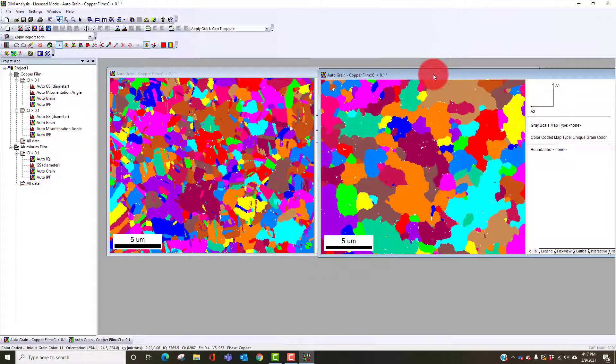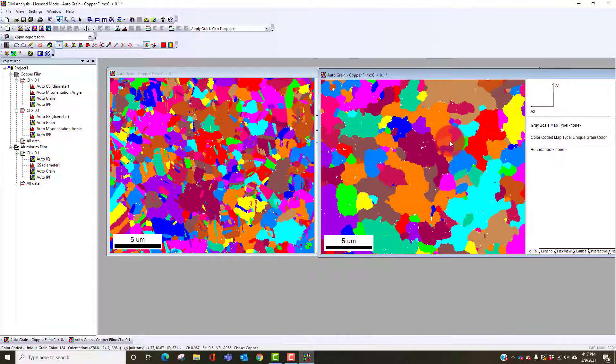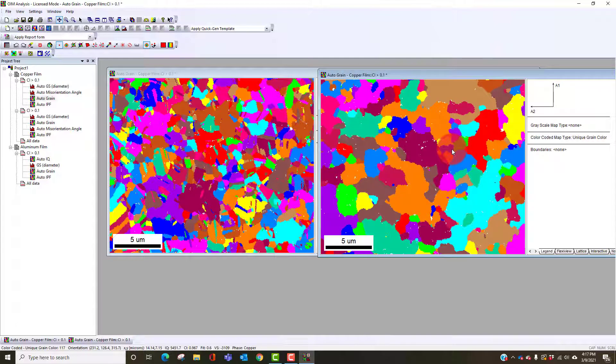EBSD is a very useful tool for having this data to be able to group together similar orientations to quickly find grain size information.